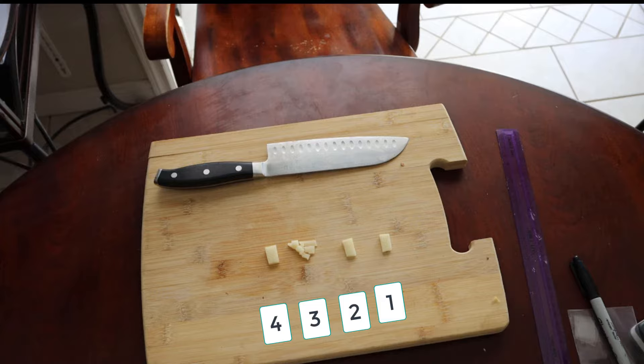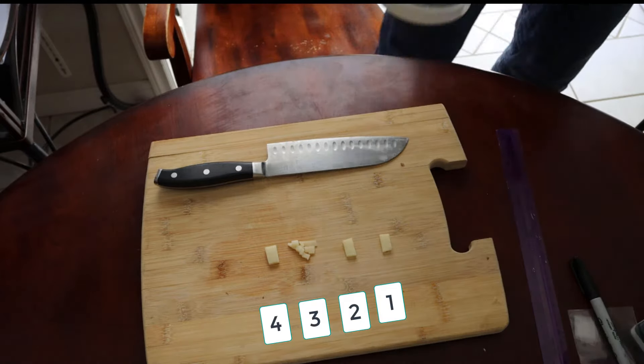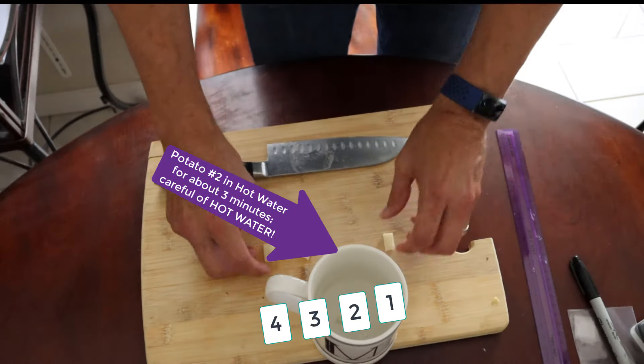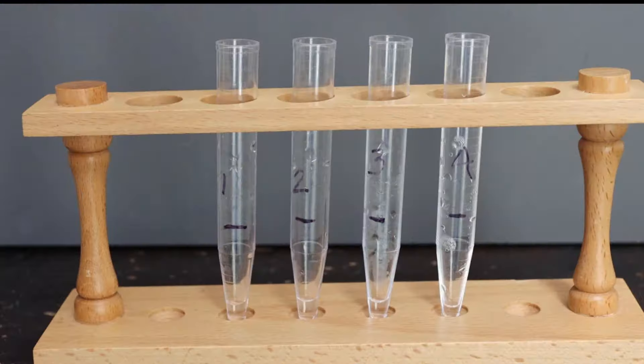So one centimeter by two centimeters by half a centimeter. And then potato two we're going to put in boiling water for a few minutes.